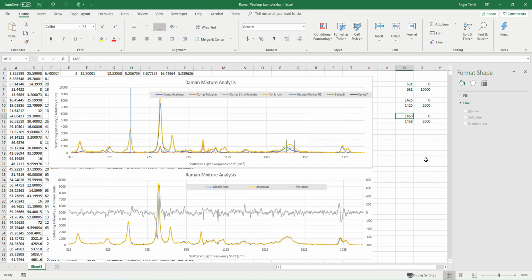How about 14? There we go. It's a little bit better.